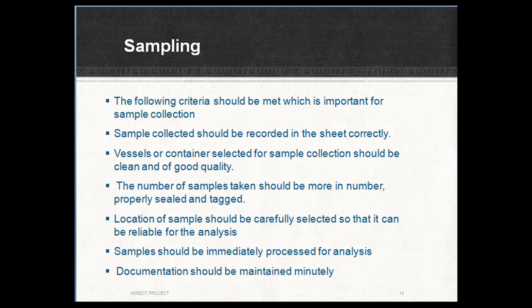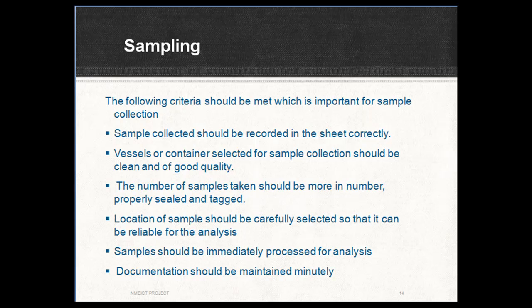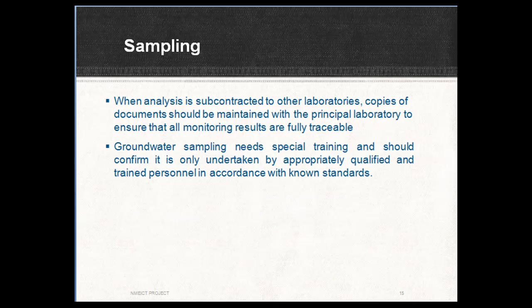The following criteria should be met for sample collection. Samples collected should be recorded in the sheet correctly. Vessels or containers selected for sample collection should be clean and of good quality. The number of samples taken should be adequate, properly sealed and tagged. Location of the sample should be carefully selected so that it is reliable for analysis. Samples should be immediately processed; if not, they should be preserved appropriately to meet international standards. Documentation should be maintained in detail, and when analysis is subcontracted to other laboratories, copies of documents should be maintained with the principal laboratory to ensure all monitoring results are fully traceable.